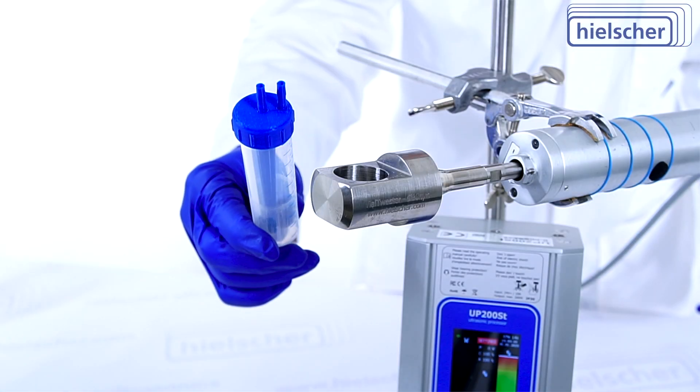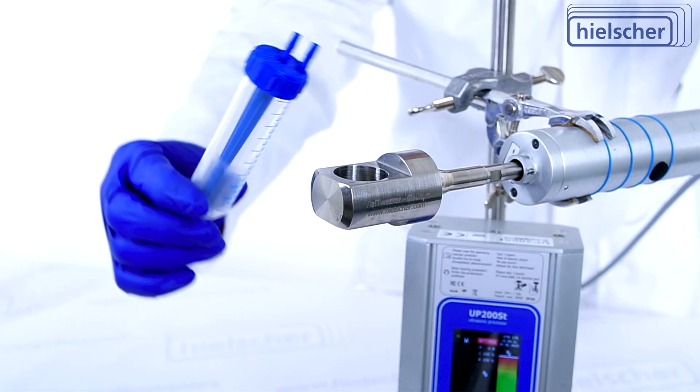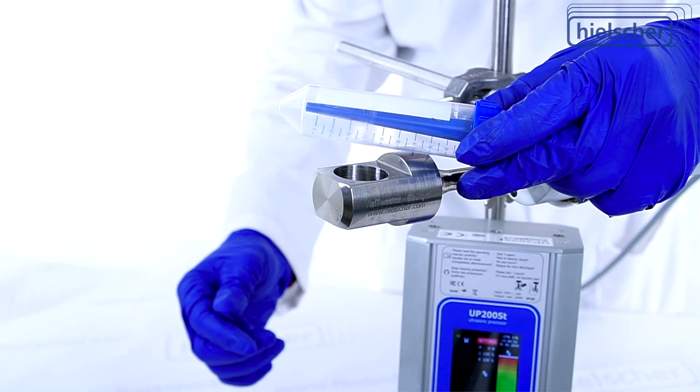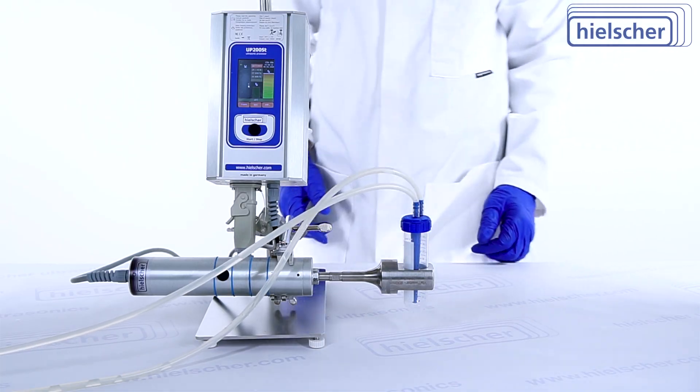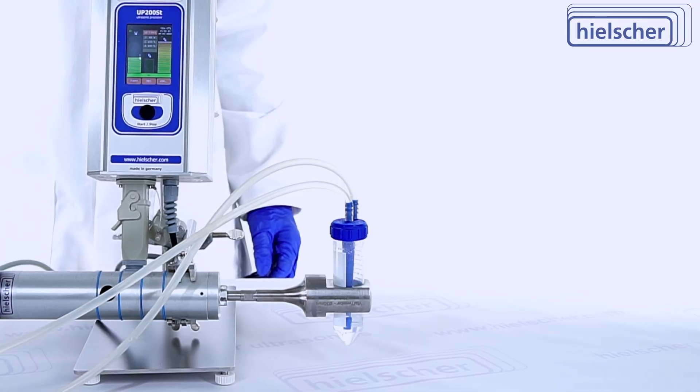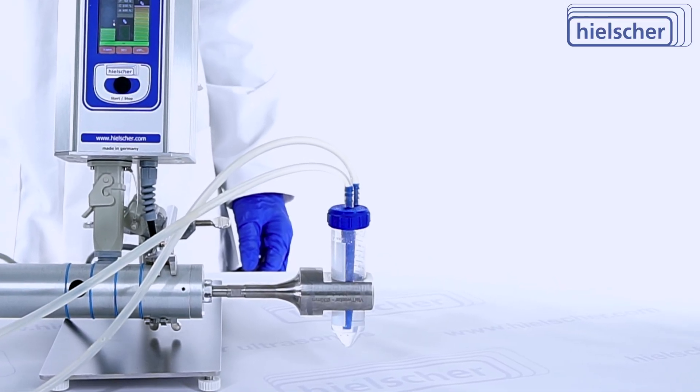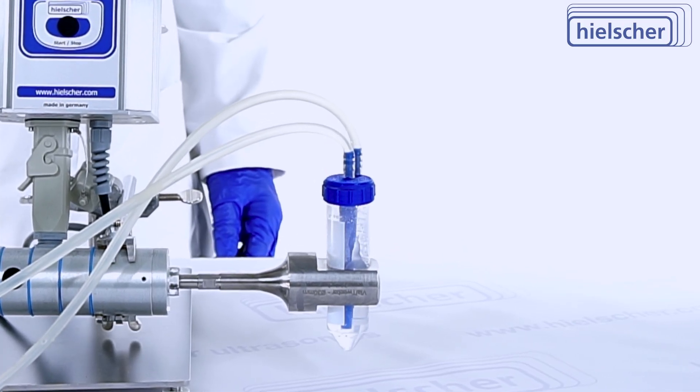When used with a specialized reactor lid, the falcon tube becomes an inline sonication system. An inlet at the bottom and an outlet at the top enable continuous or recirculating flow. Fluid enters the tube at the base, travels through the cavitation zone, and exits at the top.